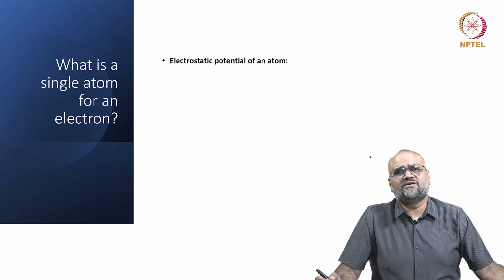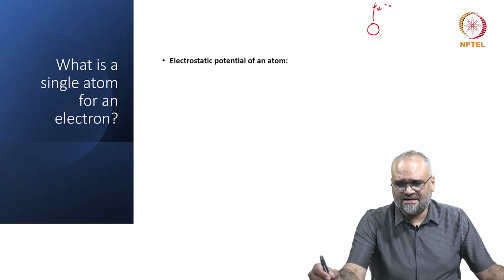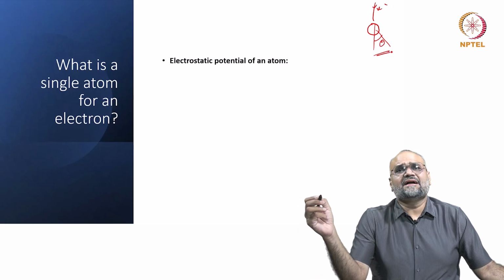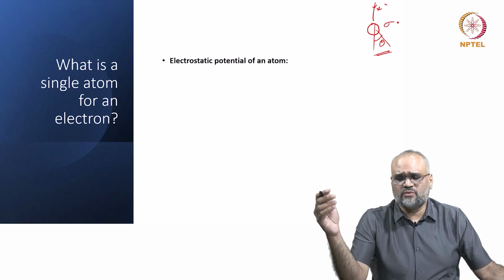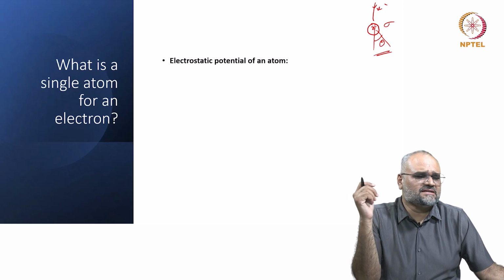When we initially introduced the Rutherford backscattering and the concepts of scattering cross section, we've seen that when there is a fast moving electron interacting with an isolated atom, this deviates its path at an angle of theta, and then we related the angle of deviation through the scattering cross section to the accelerating voltage and the atomic number of that particular atom. Based on this, we built the foundations of the mass thickness contrast.